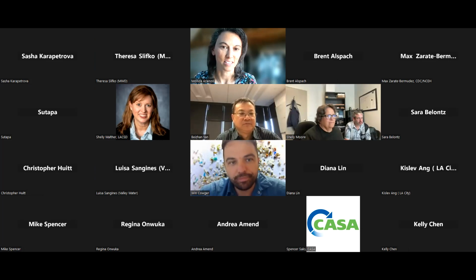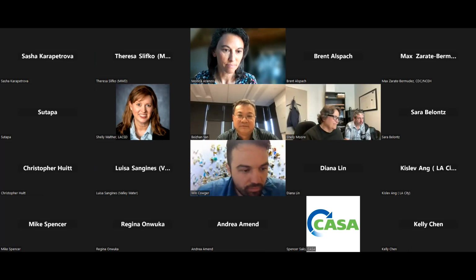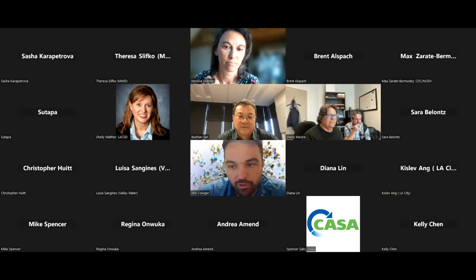Yeah. Excellent. Wynn, did you have anything you wanted to add? No, I think that's great. Thanks for answering that. I'm not sure about the false positives specifically with Raman. I just know it's a common thing that we're dealing with right now with IR. Lots of different false positives and false negatives in spectroscopy need to be squashed, but you're working with a very new method. So I'm sure there will be a lot of research to come to figure out all these details.